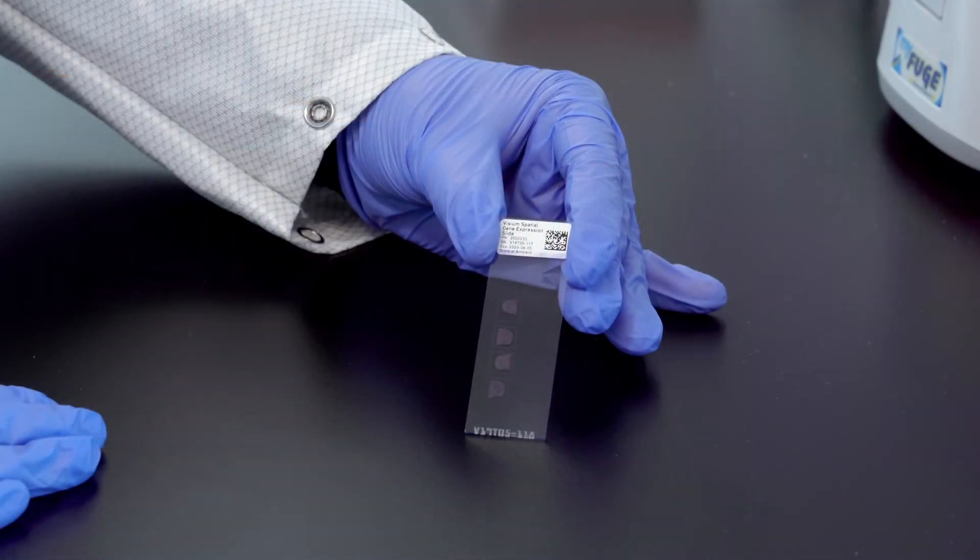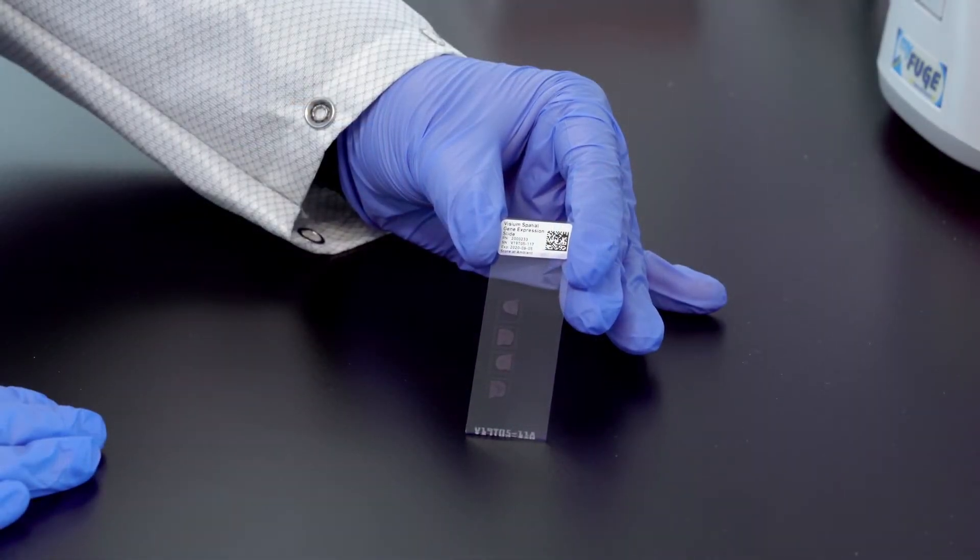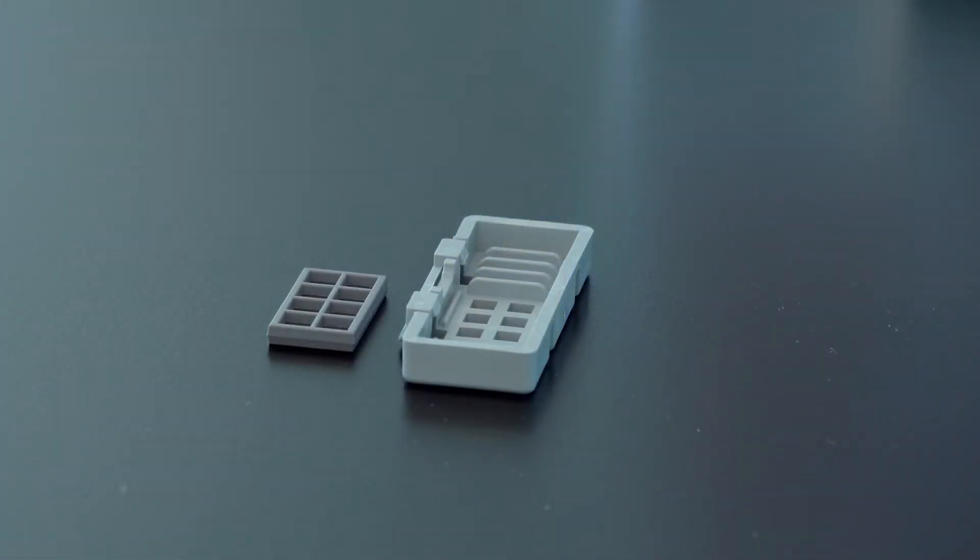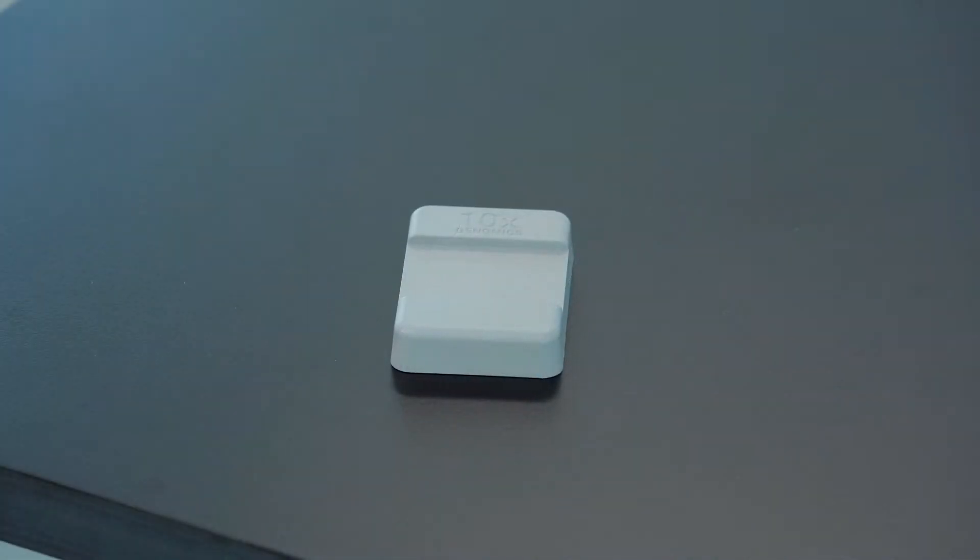We have completed tissue imaging. Now we will assemble the slide cassette. We have our Visium spatial gene expression slide with the fixed, stained, and imaged tissue. We have a slide cassette, a gasket, and the slide alignment tool.